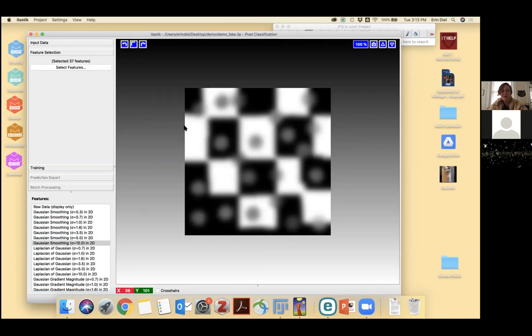So that's what this Gaussian smoothing is doing: it's taking a single isolated pixel and having the nearby pixels influence what that gray value now is, such that these circles are all gray because we mixed the white and black that made up those circles. And pixels that are in the middle of a large black region or the middle of a large white region still look black or white, even once you've smoothed them quite intensely as far as this image is concerned.